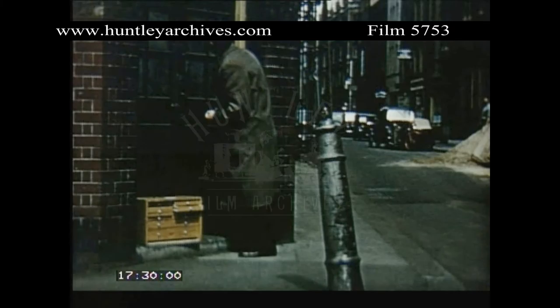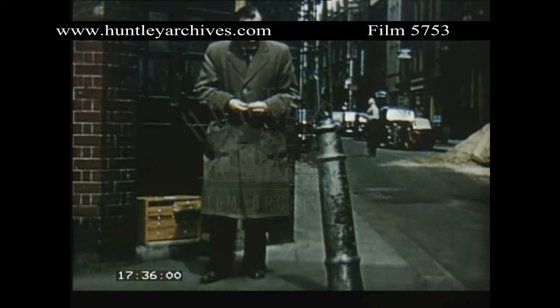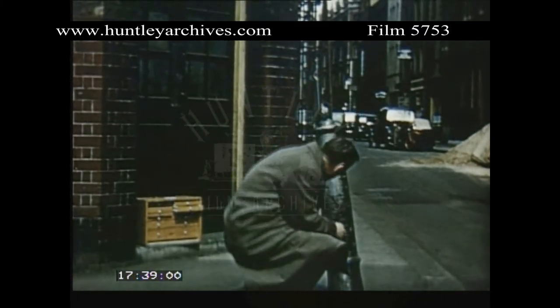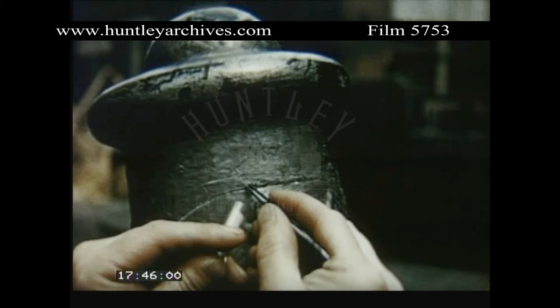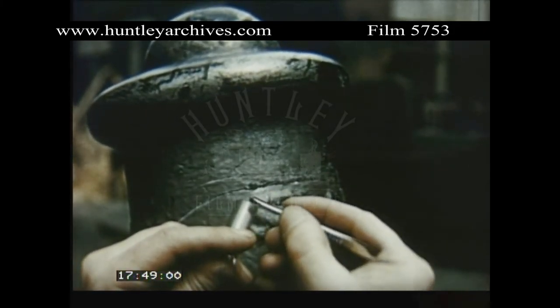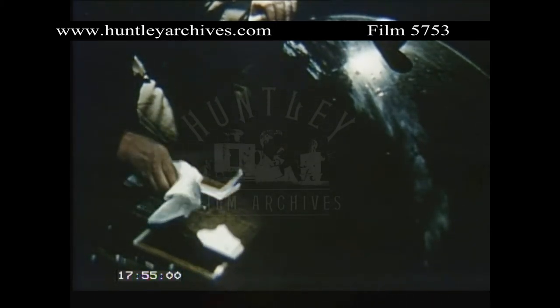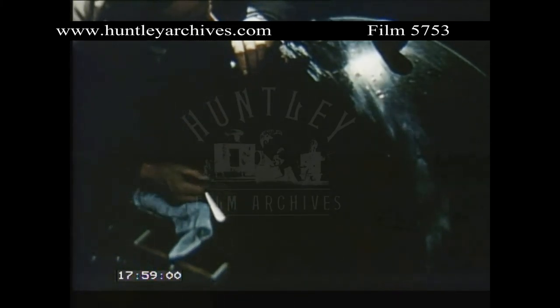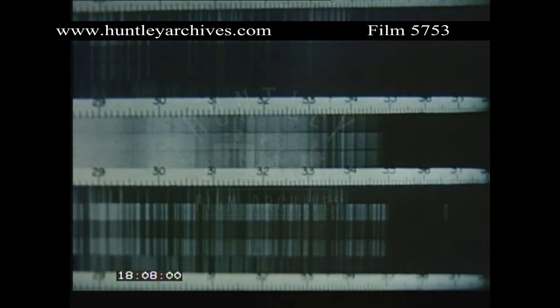In criminal investigation, the specimens to be analyzed are often minute and hard to identify. In this factory robbery, the thieves had left hardly any trace — a metallic stain on the door plates and a graze mark on the post. However, sometime later, when examining a car under suspicion, police found a likely-looking jemmy and a dent on the wing. A possibility confirmed by the examination of the resulting spectrogram: a match between the jemmy and the stain on the door plates, post and car wing — sufficient evidence that this was the car involved in the robbery.